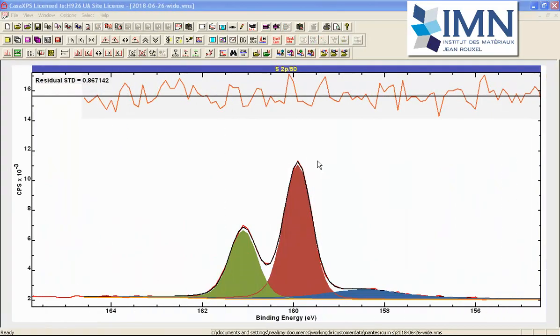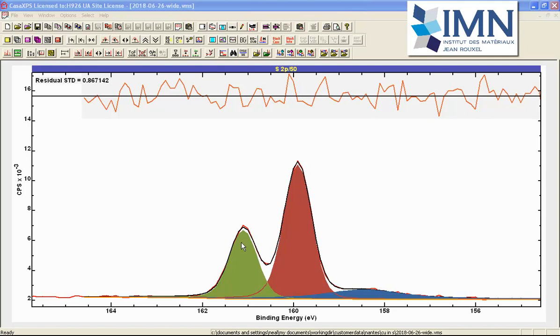When data are fitted with a peak model, the first objective is to reproduce the data with the peak model, and we measure this in terms of a residual standard deviation. For pulse-counted data with a multiple detection system, we would expect a good reproduction to be consistent with a residual standard deviation as shown here. The peak model itself is constructed from a set of components, and the number of components represents an input to the peak model. We are making assumptions about the chemical state within this sample, and we add peaks on the basis of our understanding of the sample.